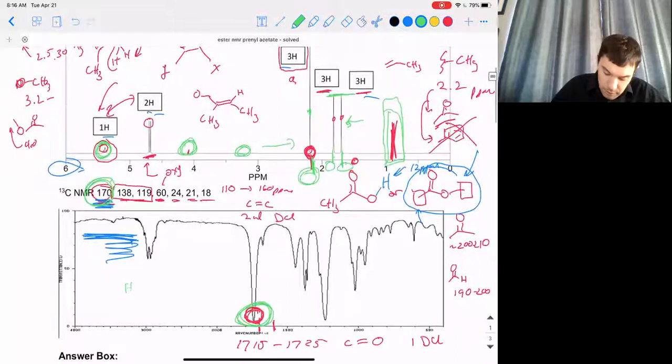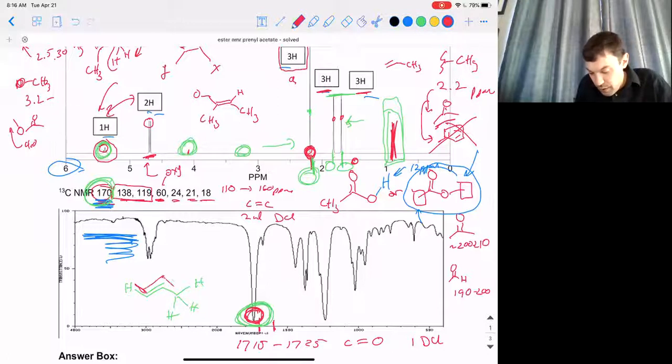And so if I put that H on a double bond, and then I have the methyl H's here, and I sketch this out, you can see that you can get a W. So sometimes it's called a W coupling. Often it's very, very small. Often we actually miss it in the NMR unless you deliberately go look for it.